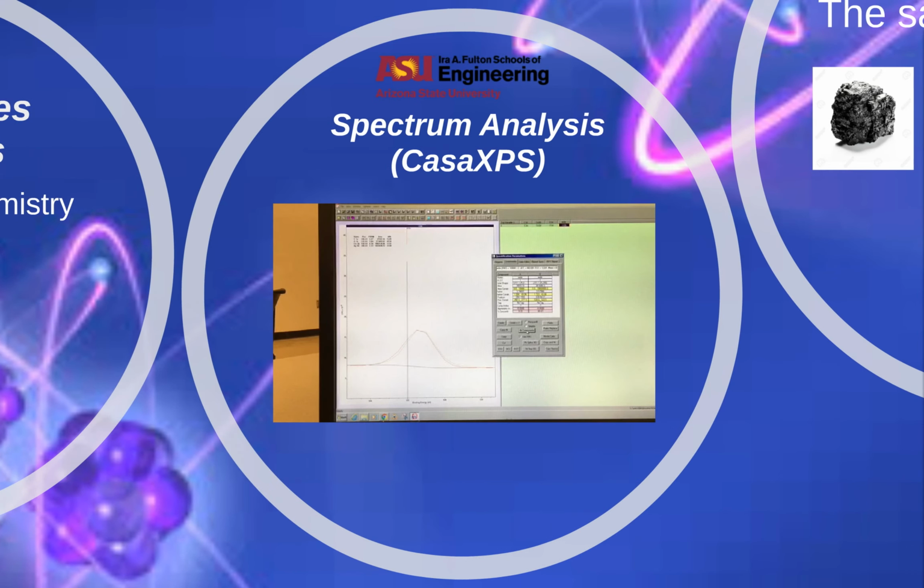Spectrum analysis with CASA XPS. So this is scanning through. This is a live feed of obtaining the data, where the x-axis is the binding energy and the y-axis is the counts per second. All they're doing to do this is changing the setup. XPS data needs to be extracted into the CASA program.